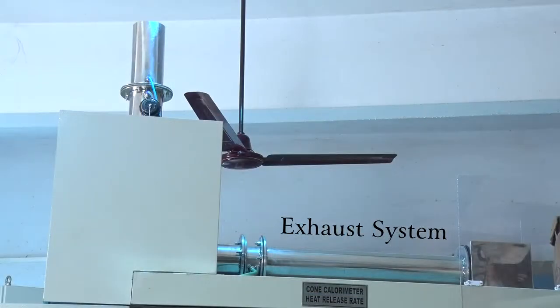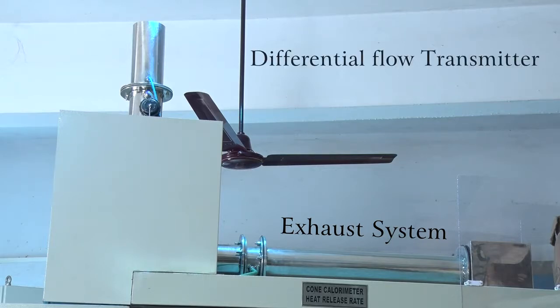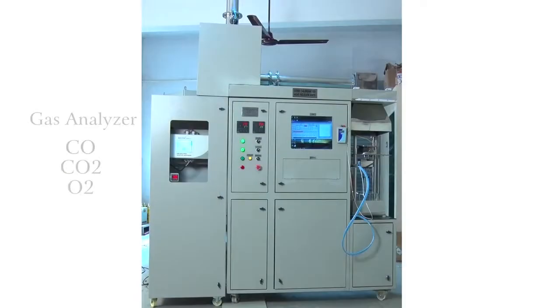In the exhaust system — the chimney — we have a gas sampler, a temperature sensor for stack measurement, and a differential flow meter. We also have a Gas Analyzer which gives continuous measurement of CO, CO2, and O2 gases, providing digital output to the software.